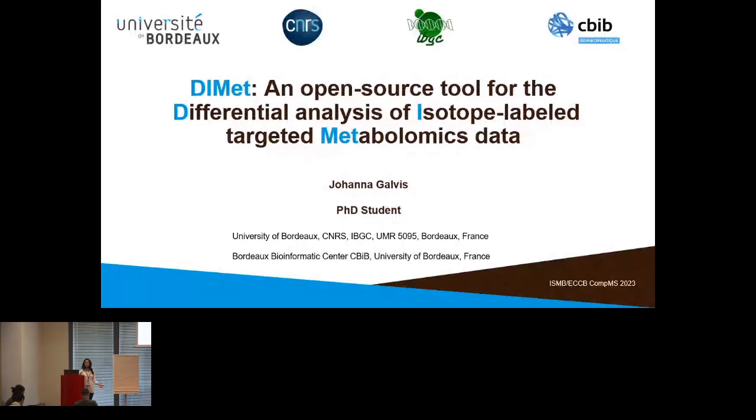And we follow the propagation of this labeled substrate across the different reactions of the system by measuring the isotopologues. For those that are new in lab techniques, isotopologues are the different species given by the number of marker carbons in the molecule. And as I am depicting here for citrate, we can express these isotopologues in percentages to be able to decrypt the behavior of the reactions.